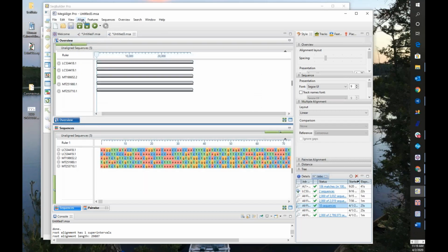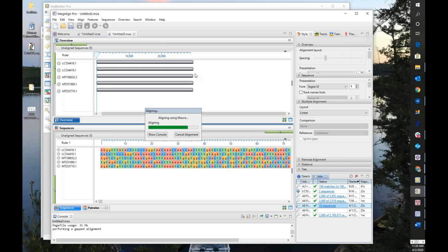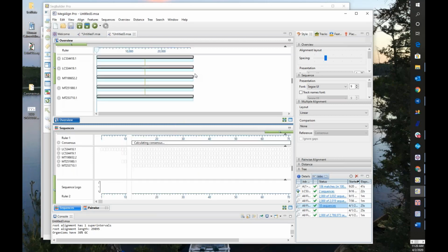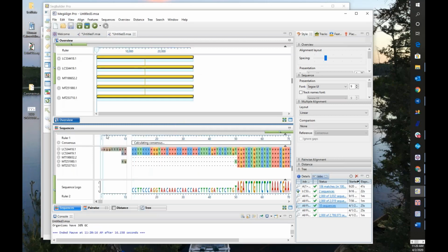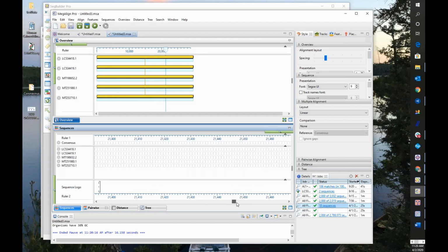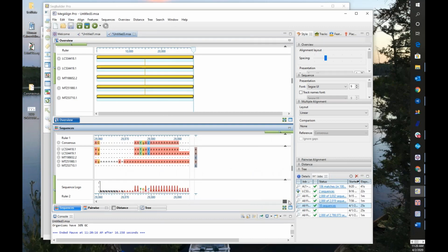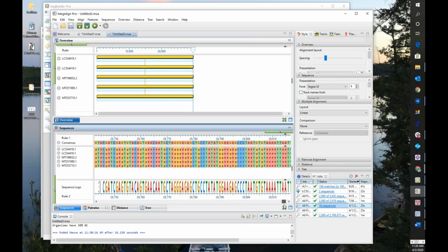And in this specific case, if I wanted to do a genome alignment of those different coronavirus strains, what I just basically did here is I used our MAUVE algorithm built into MegAlign Pro. I can actually show the similarities and differences between these different novel coronavirus strains. So the end result is our images that you can further decorate and annotate. In this specific case, as we're looking at different strains from different parts of the world, you can look at alignment reports to see if there's any variations across those different genomes. So in this specific case, the ends of the genome would have some differences.